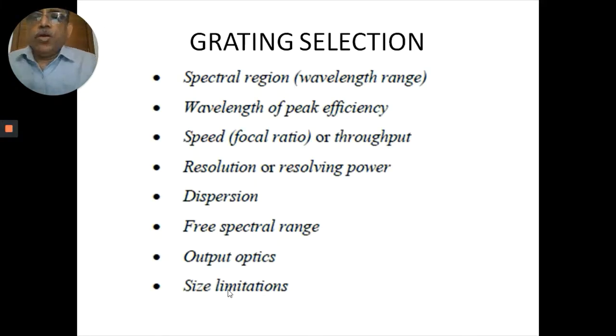Now, how do we select a grating for your monochromator? First you should look for what is the spectral region. You go based on the wavelength range that one can use, and then buy the grating.